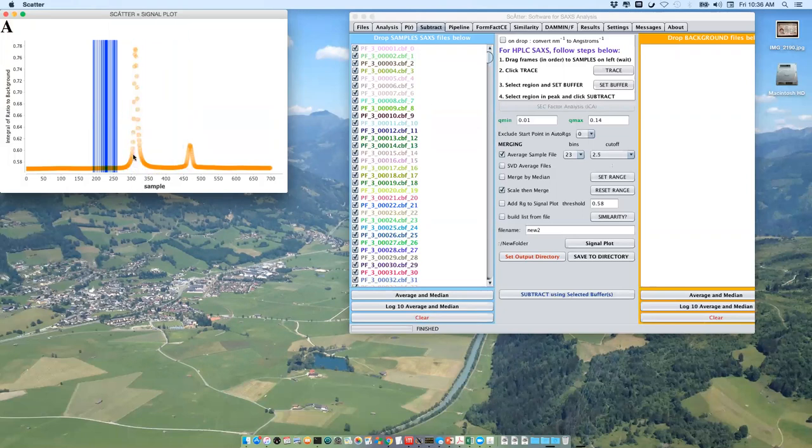First the question: what is the first, what is the second? In this column, in this range, we're expecting the void, so it's aggregations. To confirm that, I all the time look at the MALS, which you have access to too, so we bring the MALS data in for this sample to see if it's really the aggregations.